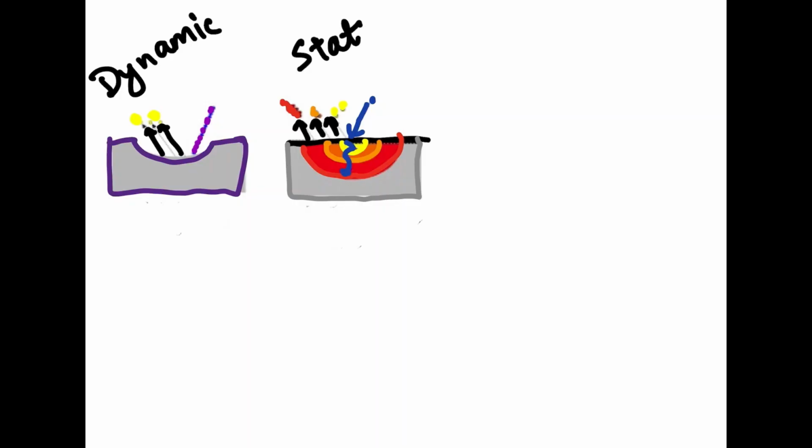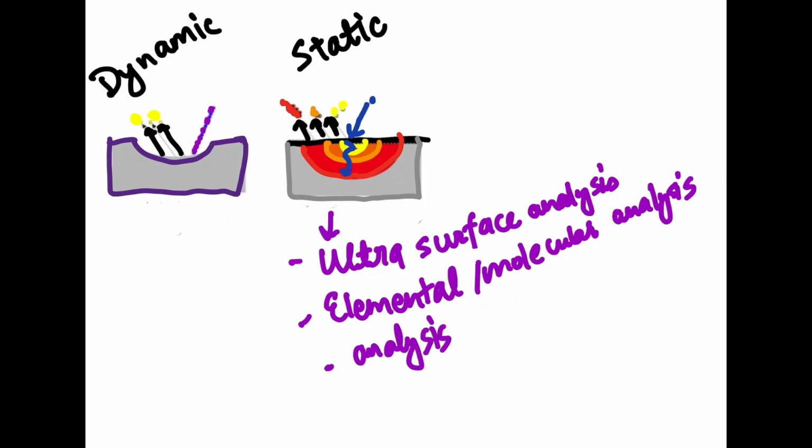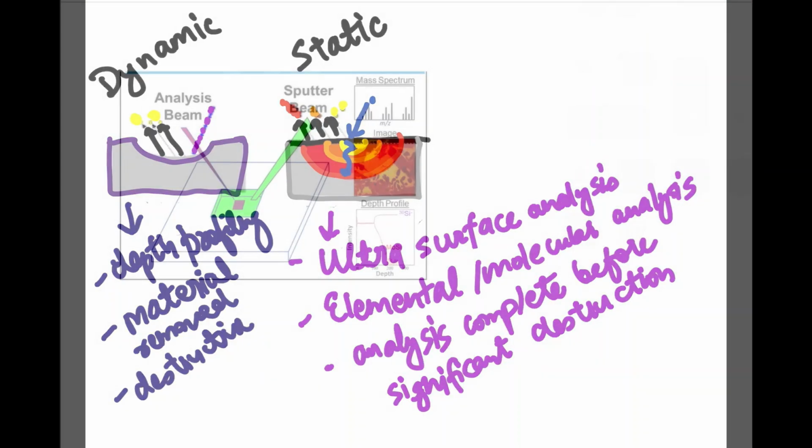There are two varieties of SIMS, static and dynamic. Modern-day TOF-SIMS is capable of doing both modes. Static mode is when there is controlled sputtering mode, where the entire analysis may be performed without removing more than 1/10 of an atomic monolayer. This is useful for surface and elemental analysis or imaging of the top 2 to 3 monolayers of a sample. It does not appreciably deteriorate the surface being analyzed. In comparison, dynamic SIMS is used to determine elemental concentrations of the sample as a function of depth. Dynamic SIMS is a destructive technique primarily used for depth profiling.